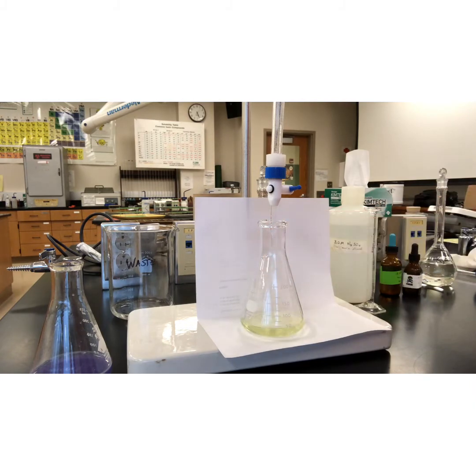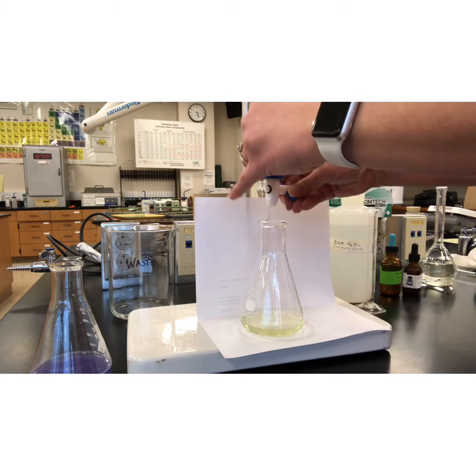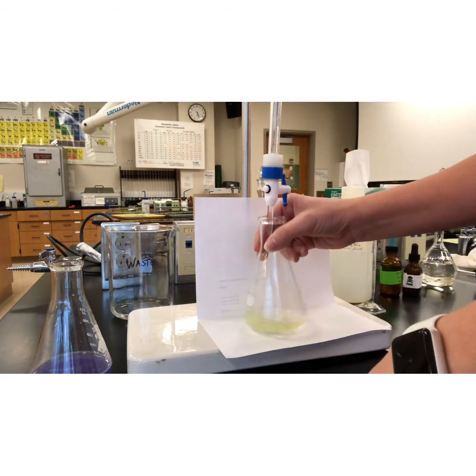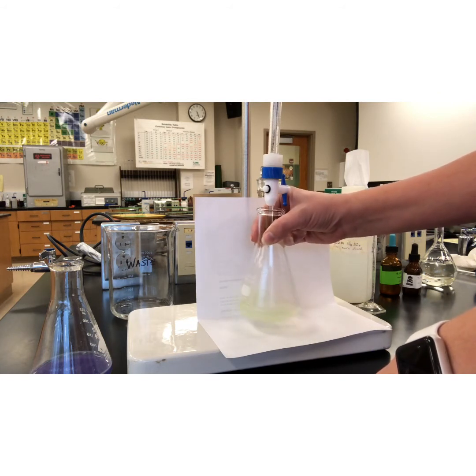So go ahead. I'm going to let it flow pretty good till we get down a ways. This one will hopefully go a little bit faster. We know approximately where that endpoint should be. Let it run and swirl. And get to about 17 milliliters.